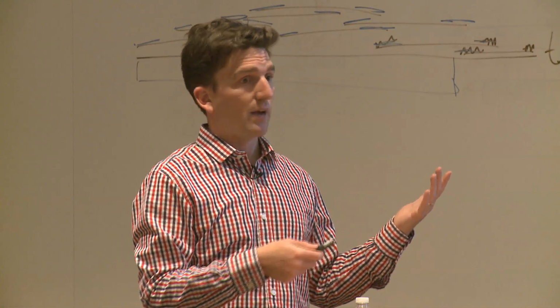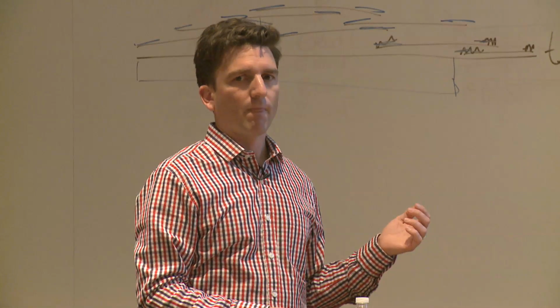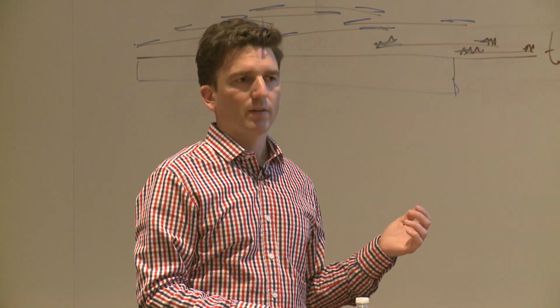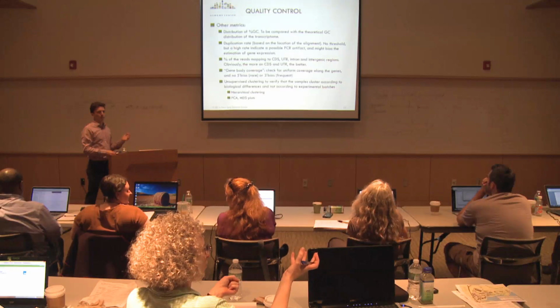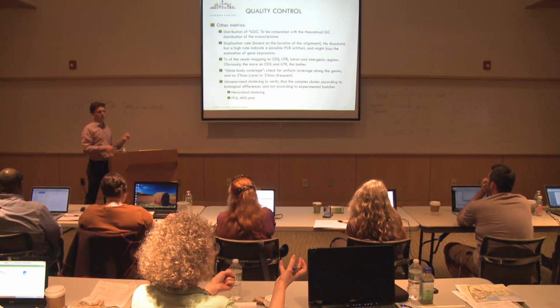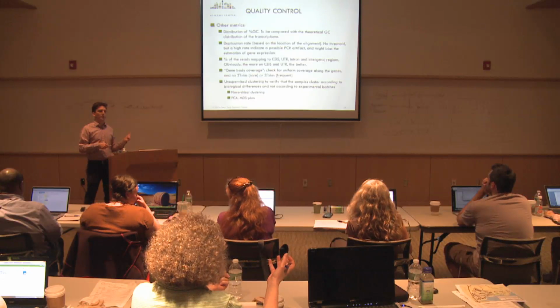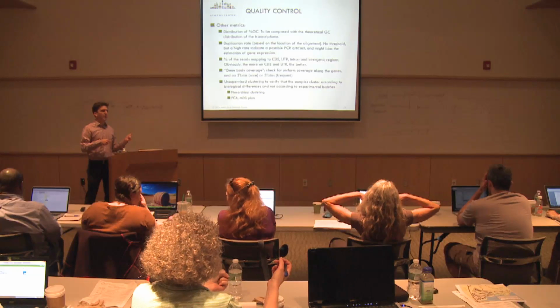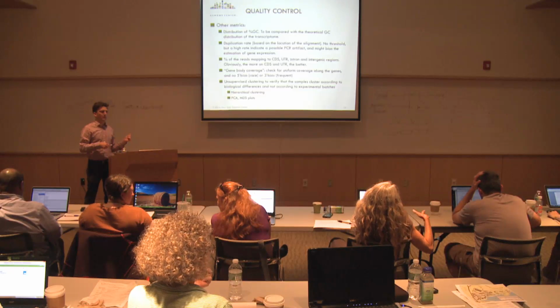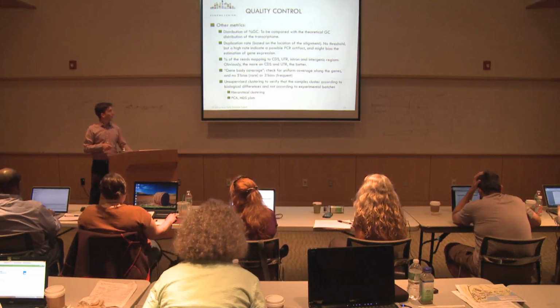Here I mean the overall expression, so not even looking at a subset of genes. Just think of a big heat map. Between your two controls, the heat maps look similar, and between your two treatments, the heat maps look similar. Exactly.